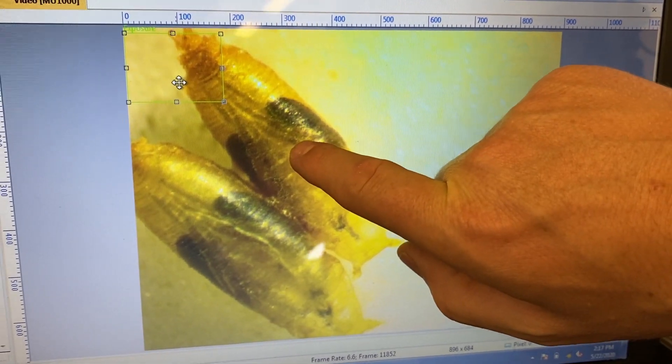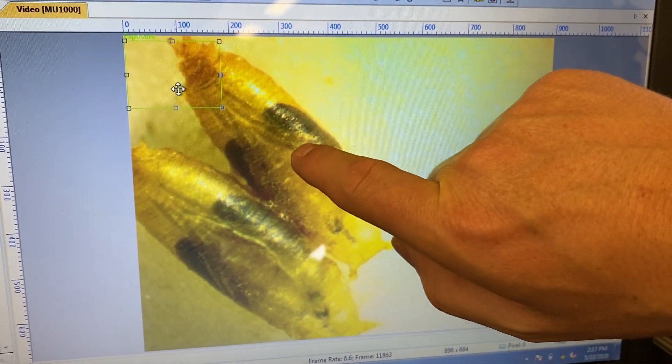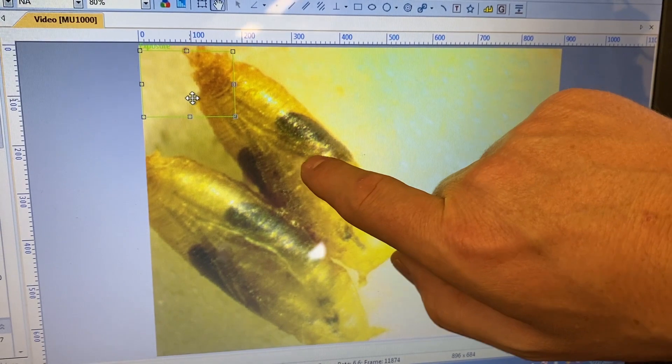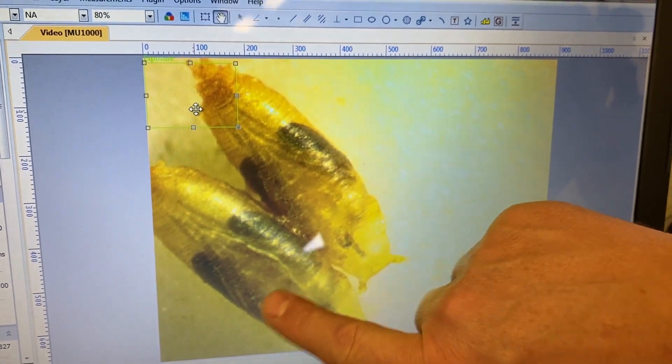Again, you're just simply looking for these two little dark marks and those represent the sex combs on the male that are missing from this female. Alright. I hope that helps. I hope that solves a lot of our problems and reduces the time in the lab while elevating the number of crosses that we're still able to do. Thanks.